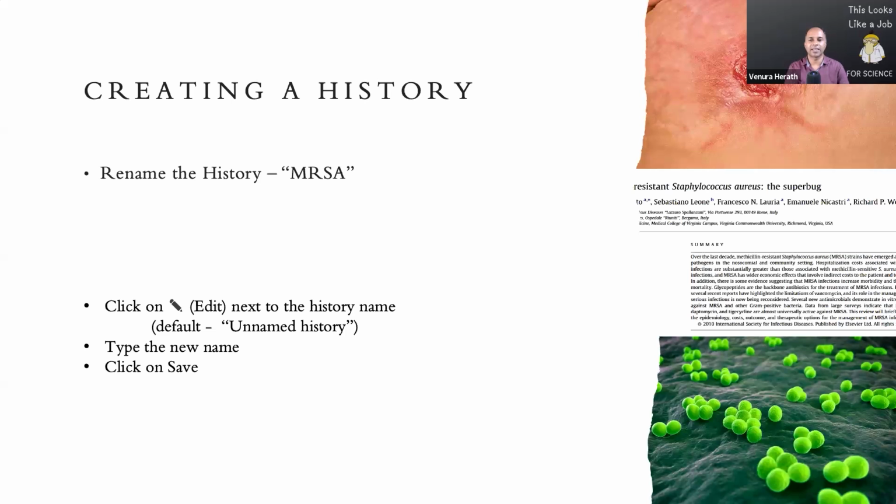We're going to move a little fast because we already completed these steps. I'm pretty sure you're very familiar with this, because last time one of you had an issue, but I think we got it resolved. Make sure you are logged into the system, otherwise it won't let you rename the history. In earlier Galaxy versions, you need to click on the name, unnamed history, so it will expand and you can change it. In the latest versions, you have this pencil icon, and you can click it and move forward.